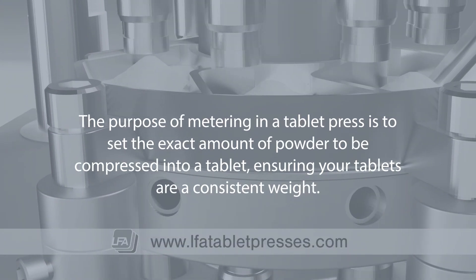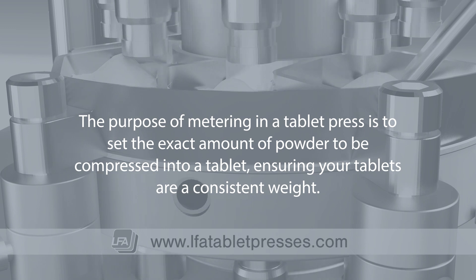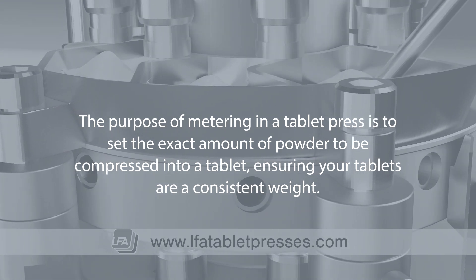The purpose of metering is to set the exact amount of powder to be formed into a tablet, ensuring your tablets are a consistent weight.